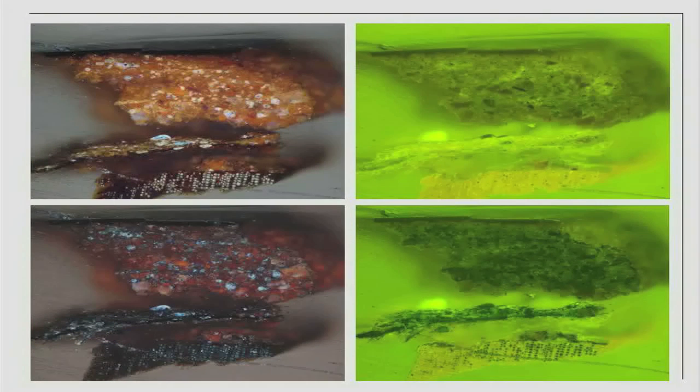To present a positive staining result for proteins, these four images depict a Chinese lacquer sample before and after staining with Amido Black. The two images in the bottom row clearly show the blue and black appearance of the foundation layer, the fibrous layer, and the wood substrate in visible and blue light respectively.